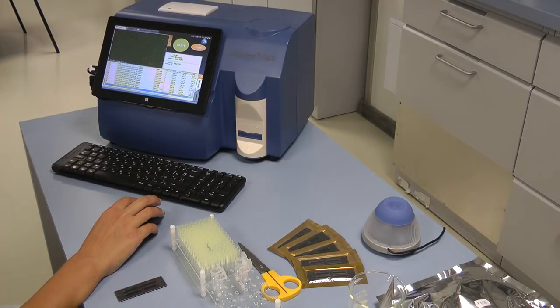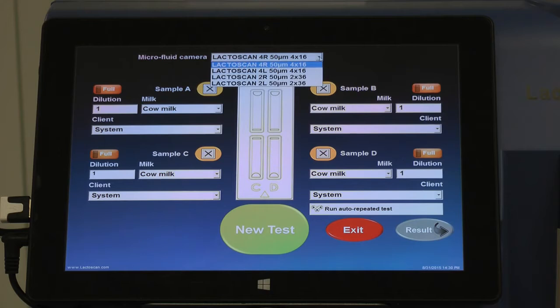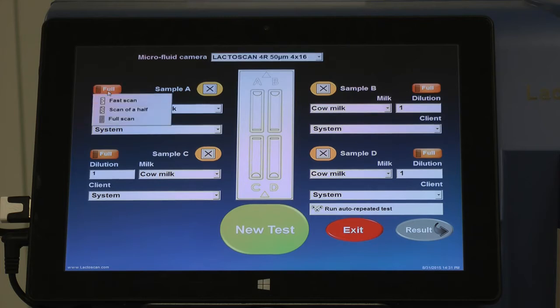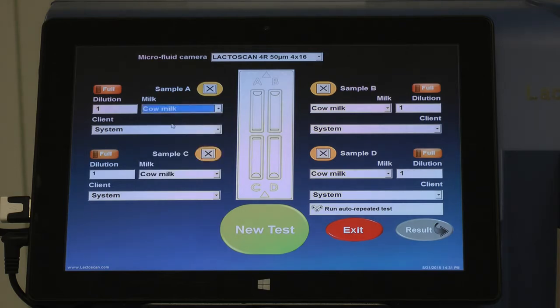Press Start on the main screen, then choose the type of chip from the drop-down menu. Choose the type of milk from the drop-down menu.